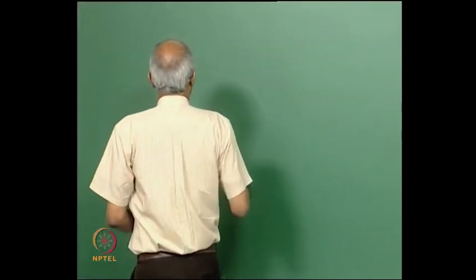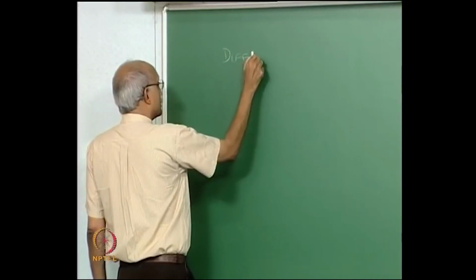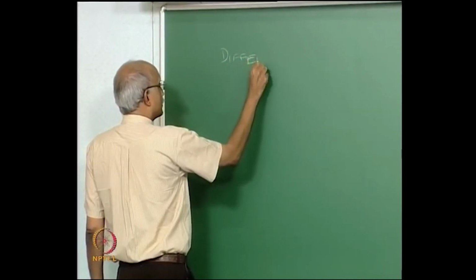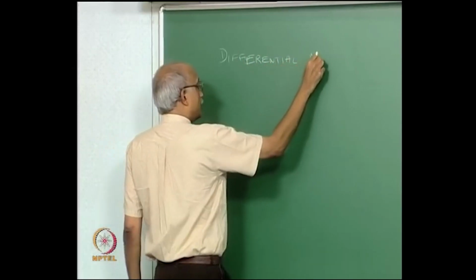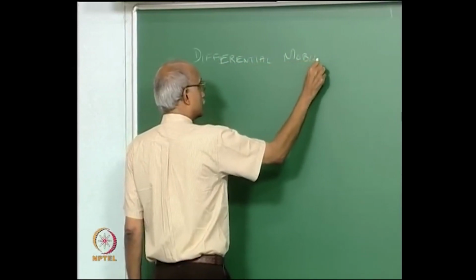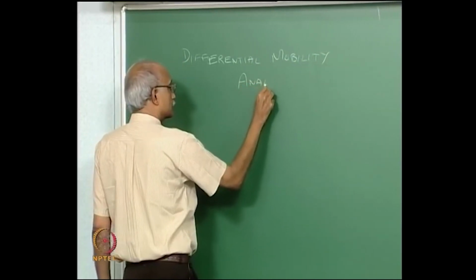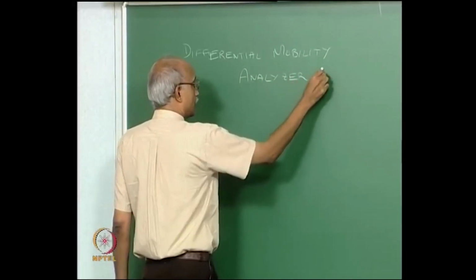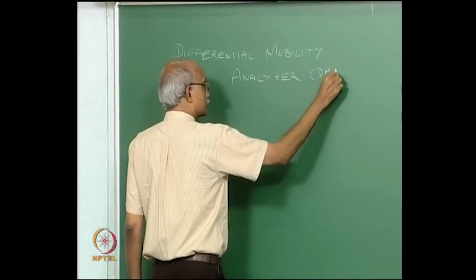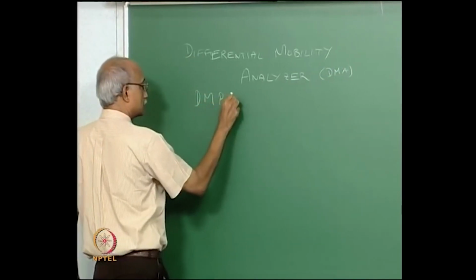is used in instruments that are called differential mobility analyzers, or DMA. They are also known as DMPS.